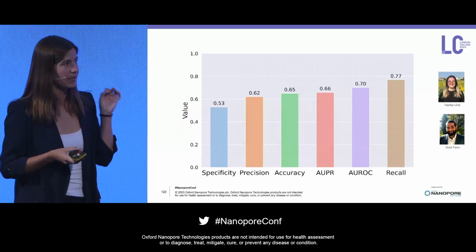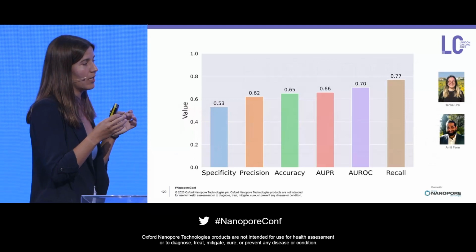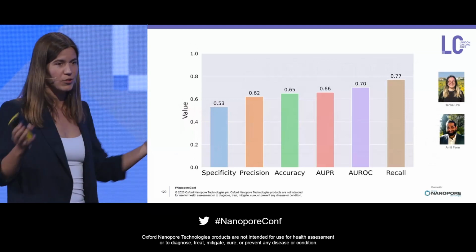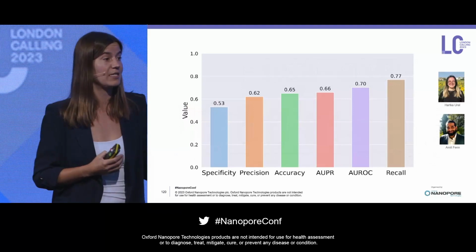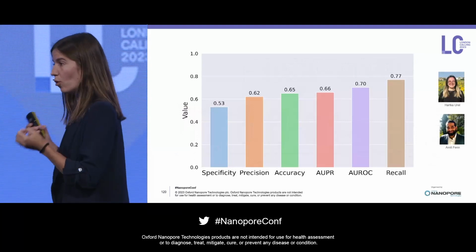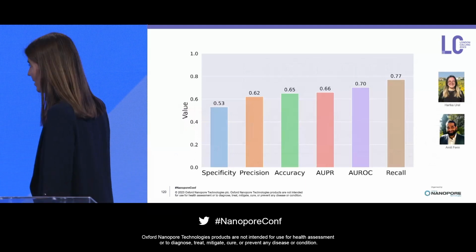data for this. But I think the really important point is that if we can manage to get a model like this together, all of you could just go back and apply it to your squiggle data, and we would get an idea of if this viability thing is a problem at all in our metagenomic studies, or if all microorganisms were alive anyways.